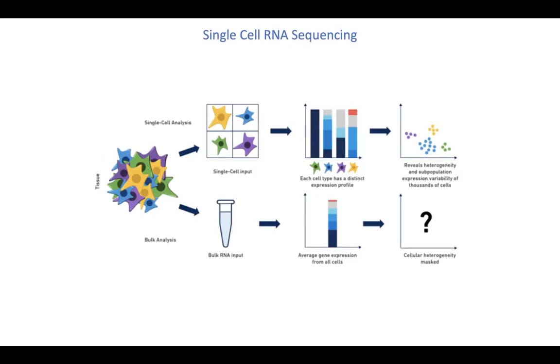In recent years, this has become the gold standard for determining different cell types over other methods like cell surface protein expression.